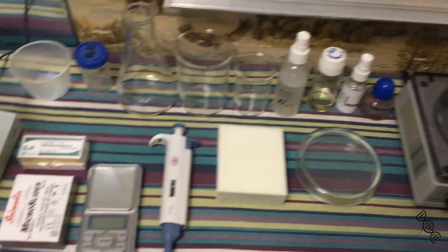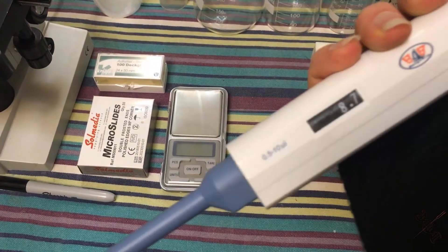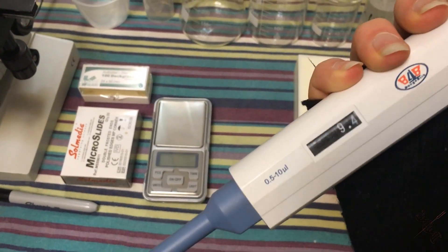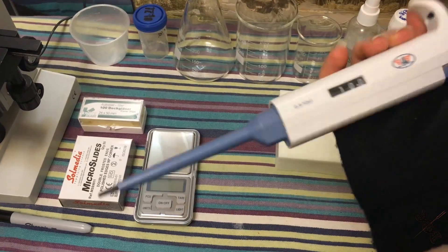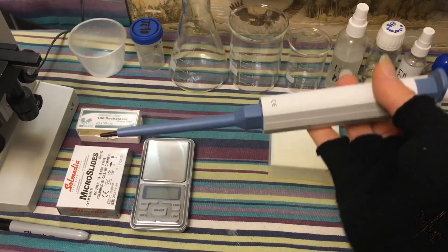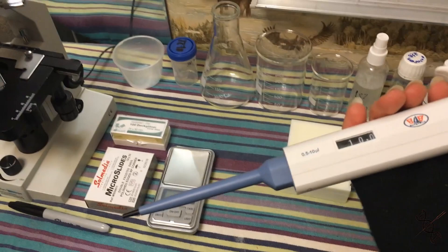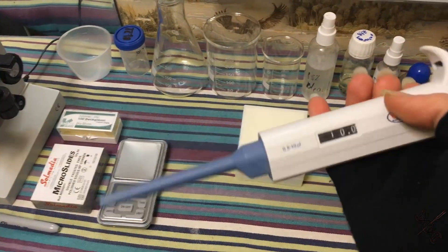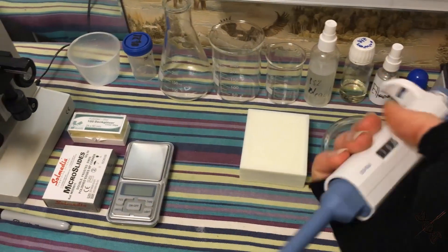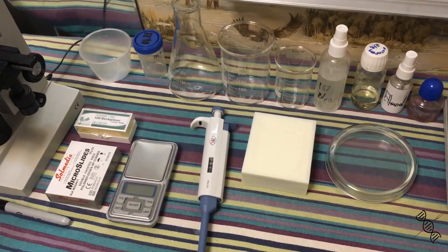Next, we've got some micropipette — this is an ordinary 10 microliter micropipette, plastic. It works pretty well. All it needs occasionally is some adjusting and making it more stable, but for a home lab and the stuff that I do here, it's more than fine.